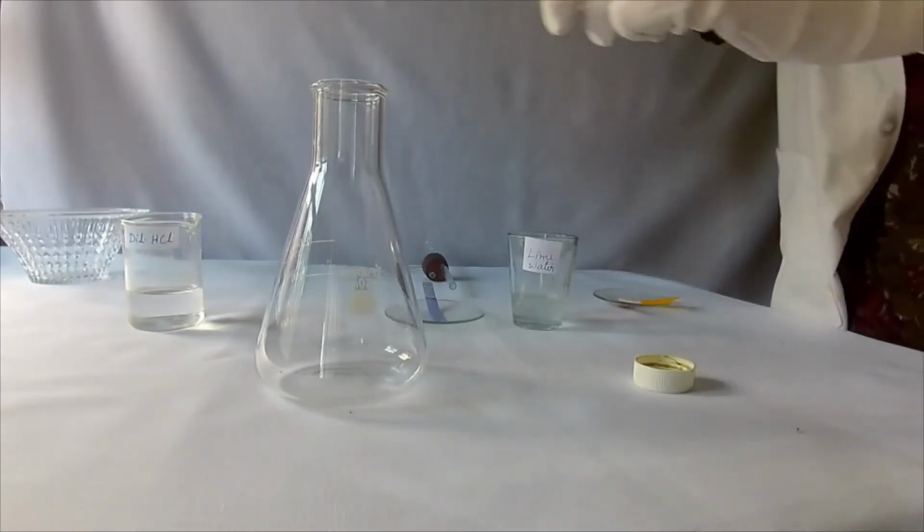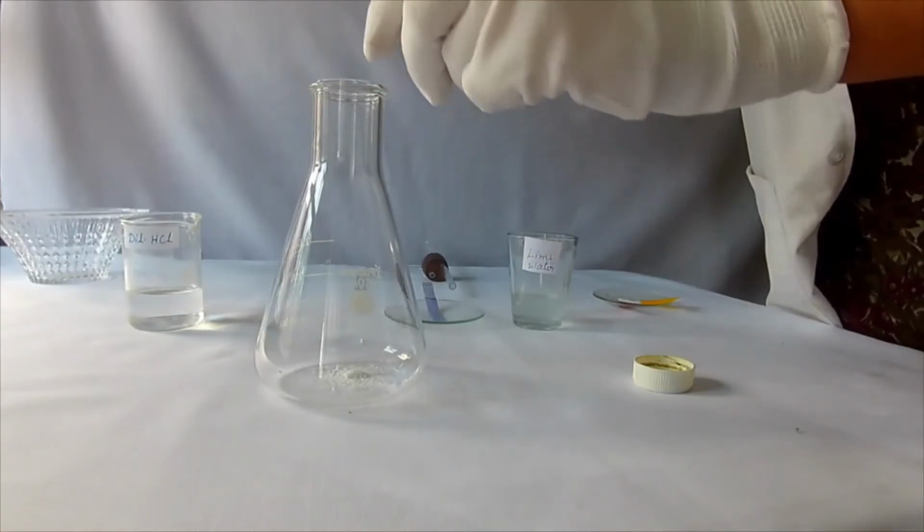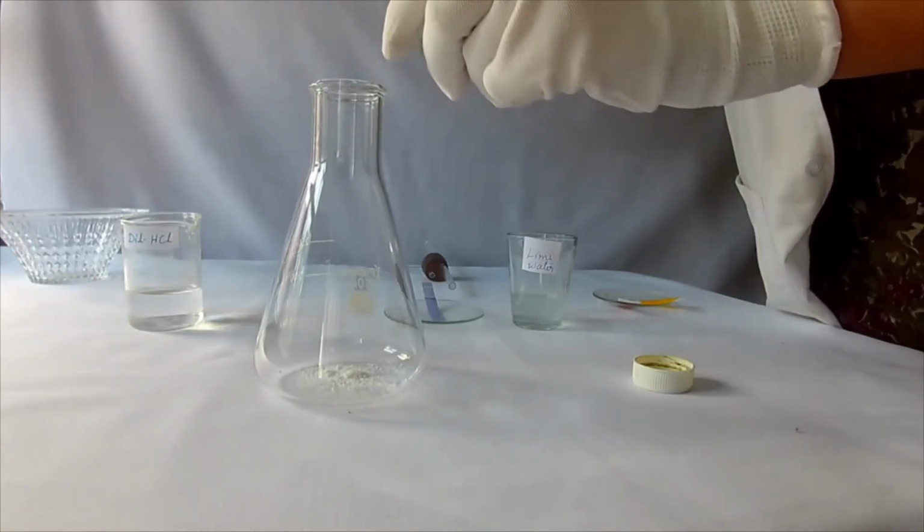Now add sodium bicarbonate salt into the conical flask.